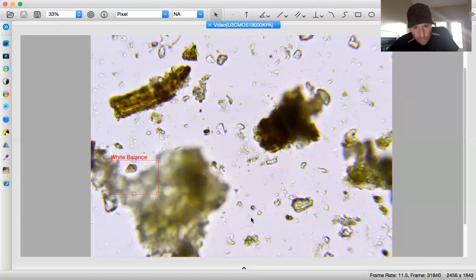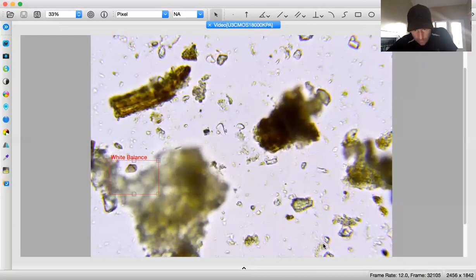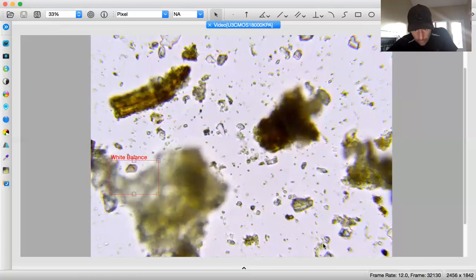I happen to know that these are fruiting structures of Ascomycota, but they are not filamentous, so I don't generally record them if they're recognizable as a fruiting structure like this one is, with the Y formations and the kind of bulky filament to it, uneven, not uniform. This one, however, might be a little closer to something that's uniform that we could measure.